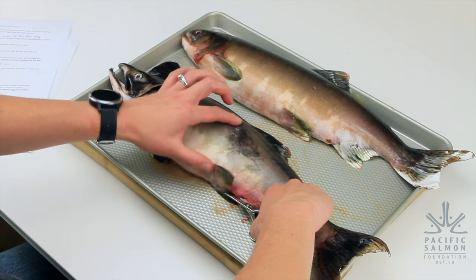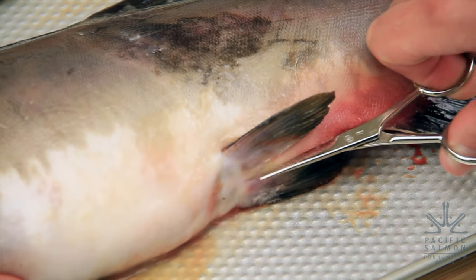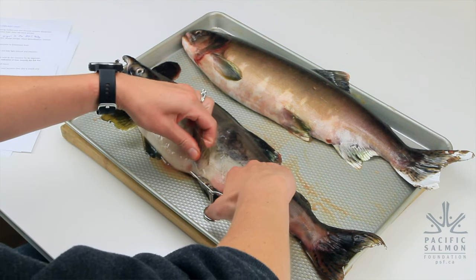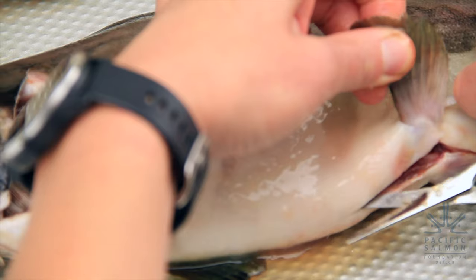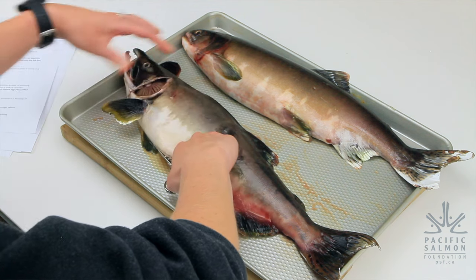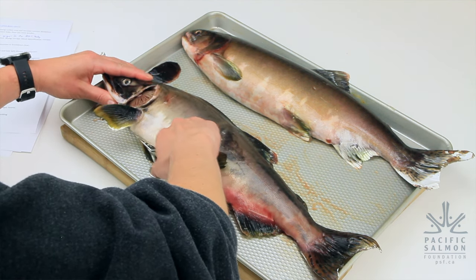Now we're going to look at the inner organs of this fish. We're starting here at the vent and we're going to cut all the way up the body cavity. We have to be careful when cutting so we don't cut through the stomach.